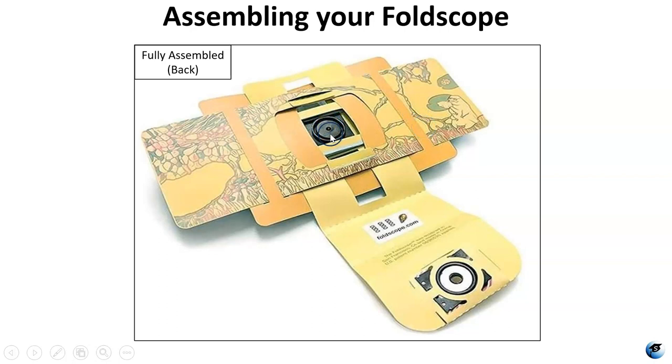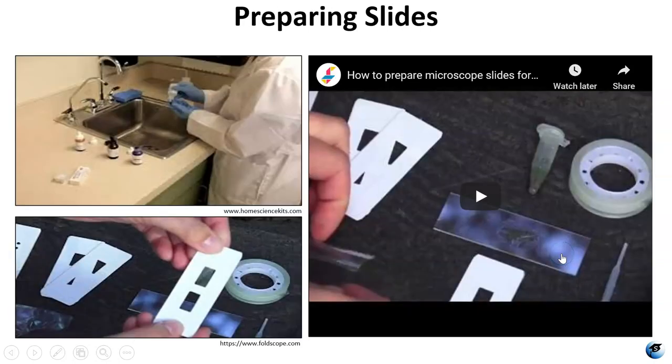This here is the lens that is being held with that coupler you saw on the front, and there is another coupler here on the flap. Once you have your Foldscope assembled you can use it to view slides.